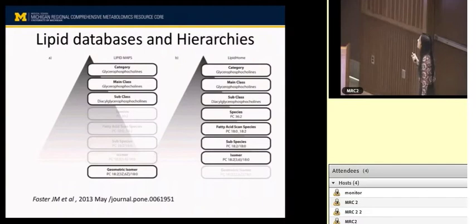where PC is phosphatidylcholine, the name of the class, and then 36 is the number of carbons, and then 2 is the number of double bonds. So this is the information that we give in our reports, and for the fatty acyl species, there can be multiple combinations. We can check these things manually, but right now in our data report, we don't give exactly what the acyl species are.